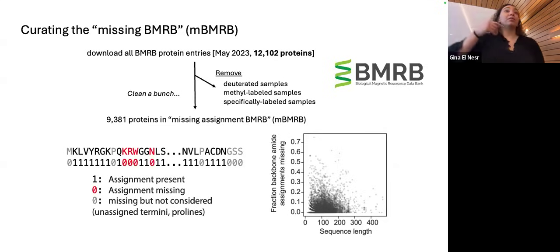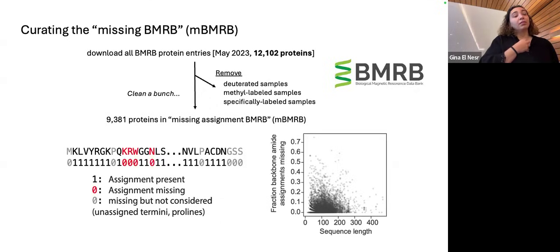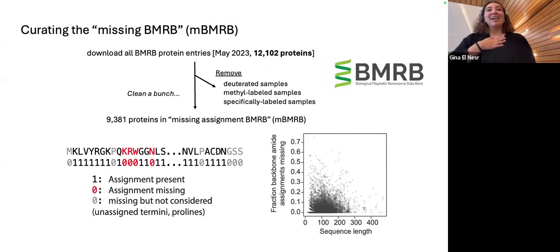Kind of on the same thing, could you somehow correlate the dispersion of the spectra? Sometimes if you have a very narrow range, it might be harder to assign peaks. So the reason they're not assigned is due to ambiguity rather than broadening. Well, from the proteins that we removed, if over some fraction of the protein there were long stretches not assigned, we removed those, to hopefully remove cases like this, but that's certainly something in the assumptions.